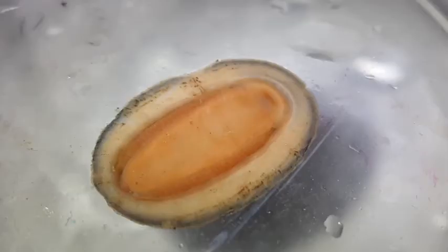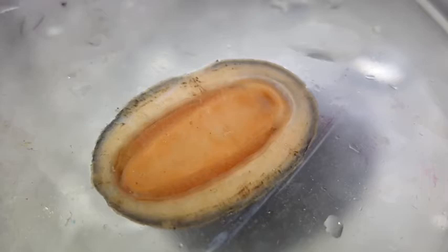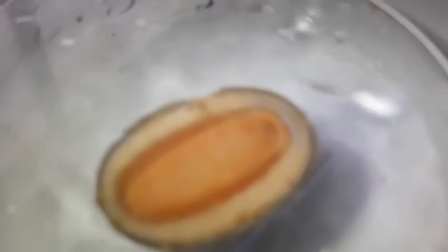Let's have a look at the ventral side of the chitin now. I've placed it on a petri dish and gotten it to hold on using its foot. Then I turned the petri dish upside down so we can have a nice look at the ventral side without it being too invasive for the chitin.